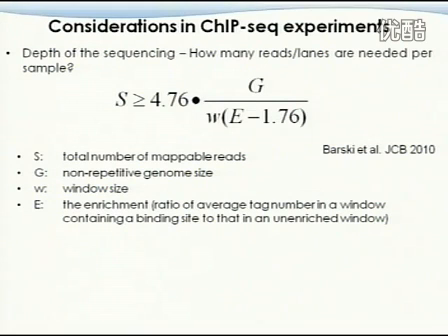And sometimes you need much, much more than that enrichment ratio. We remember that for the first Science paper on transcription factor binding, they required E equal to 5. Which means that in the real binding region, they required 5 times more enrichment than in the background region. So of course, you can justify that in your calculation, right?